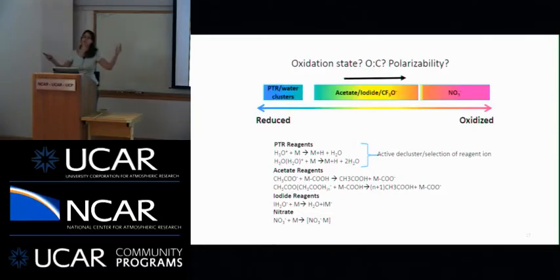So there are a lot of questions as to why you would bother with multiple reagent ions and what information this gives you. So my students and I, and then a few other groups, we've been talking a little bit recently about different types of reagent ions in chemical ionization mass spectrometry and what they could possibly mean. And about a couple of months ago, this is the figure that we were discussing.